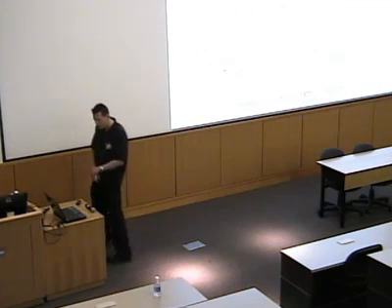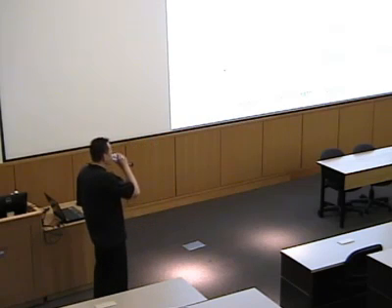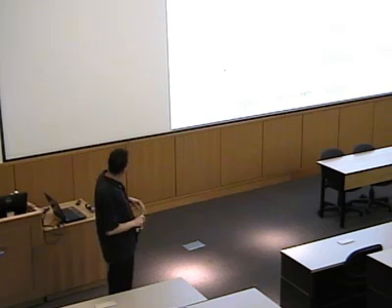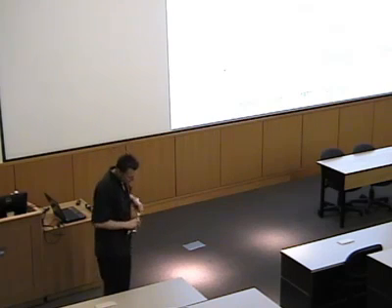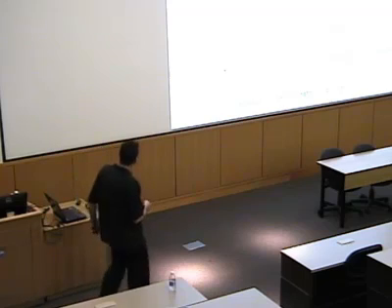So let's go on then and look at these 3 different intensity mechanisms to understand a little bit better where they come from and what the implications are, especially if you're thinking about diamagnetic versus paramagnetic systems and what that applies to. So first is the A term. The A term requires a degenerate excited state. And we'll see in a second why that is useful.